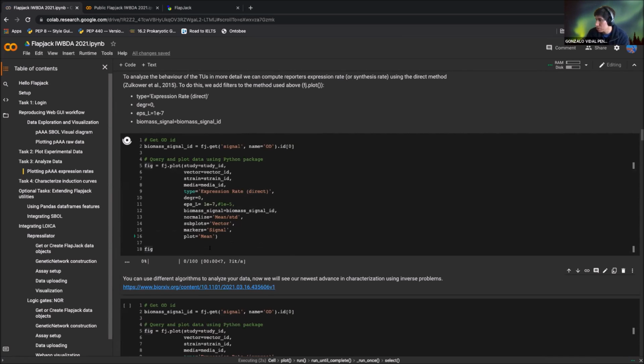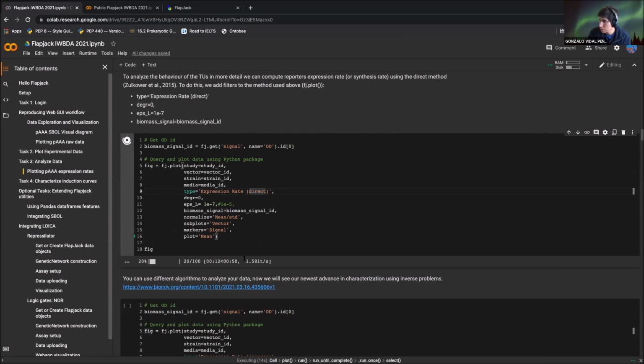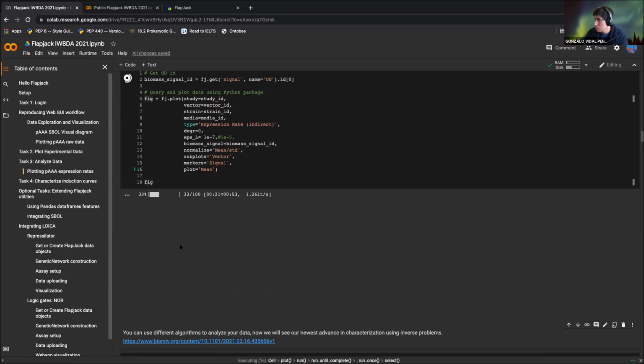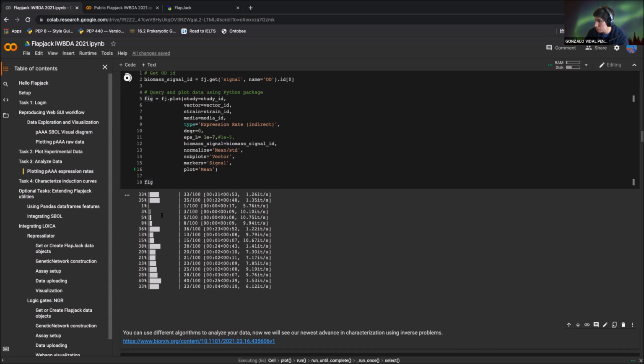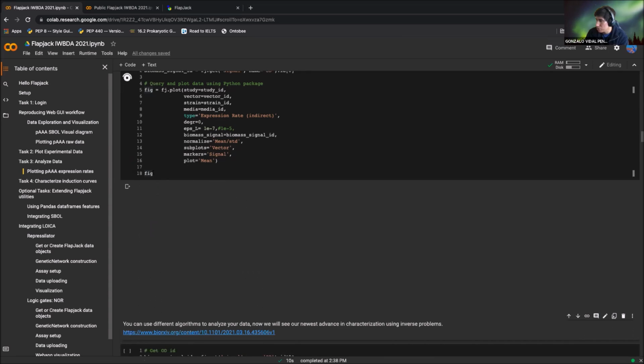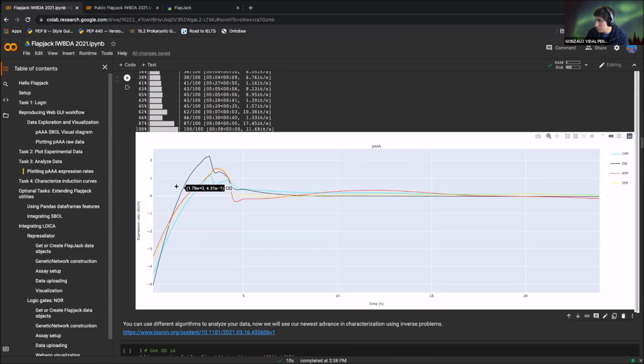Okay, this is the direct. This is because I use the same variable for all the different examples, so we delete the previous ones. So here's the direct as well. And I will test now the indirect. See if I can just hold this and test the indirect, which is a smoothing filter, and then derivation of that.